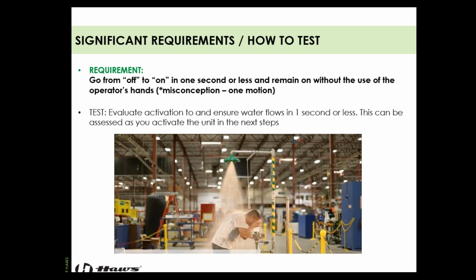You just need to make sure that flow to the heads of the device is under 1 second or less from activation. And it obviously needs to be hands-free. You're going to have other things to deal with, right? You're going to have to remove your clothing. You've got to be in your birthday suit, which is most ideal, especially with chemicals, right? You're going to continue to get exposed, especially if it's being trapped between your clothing and your skin.